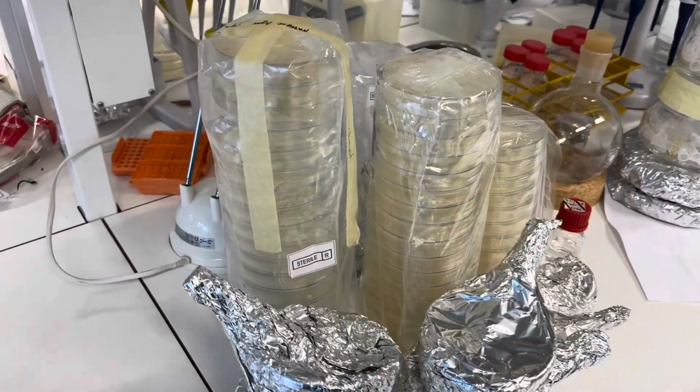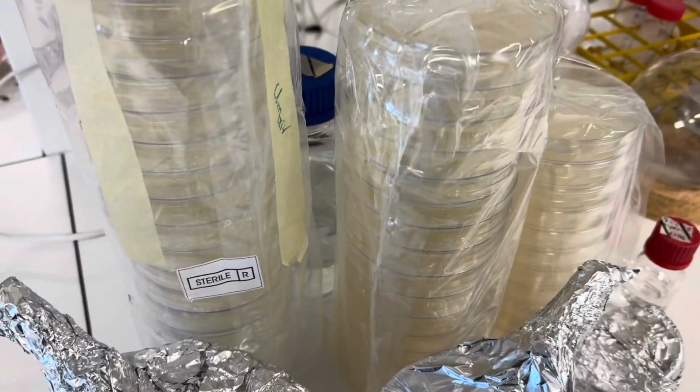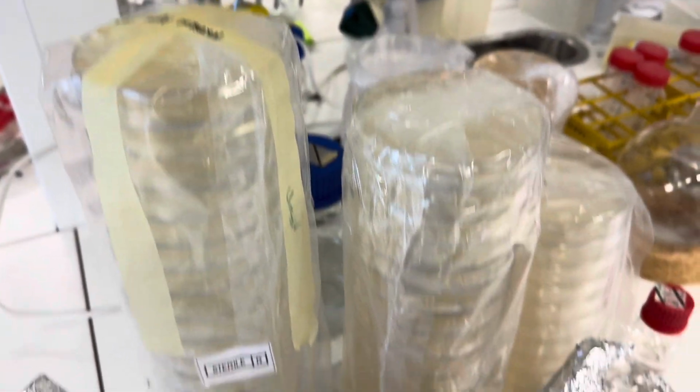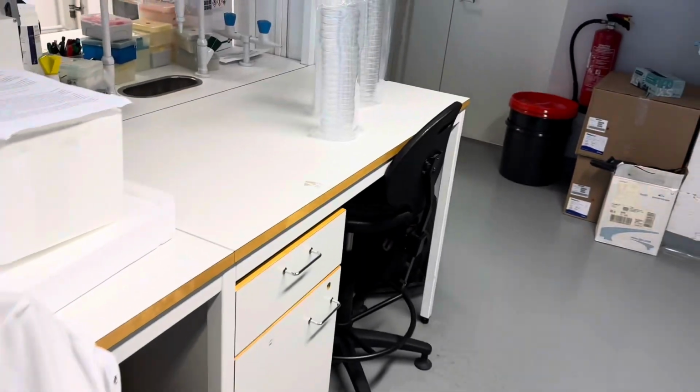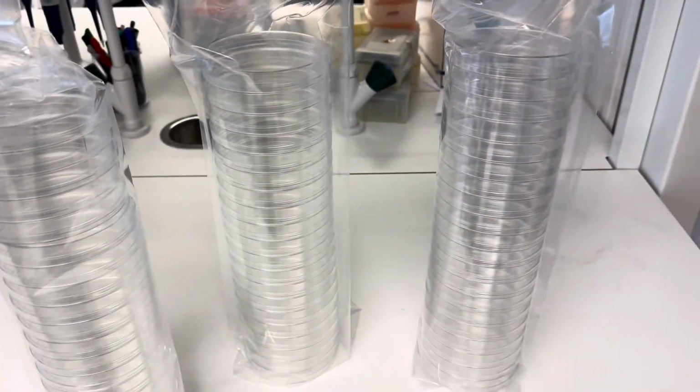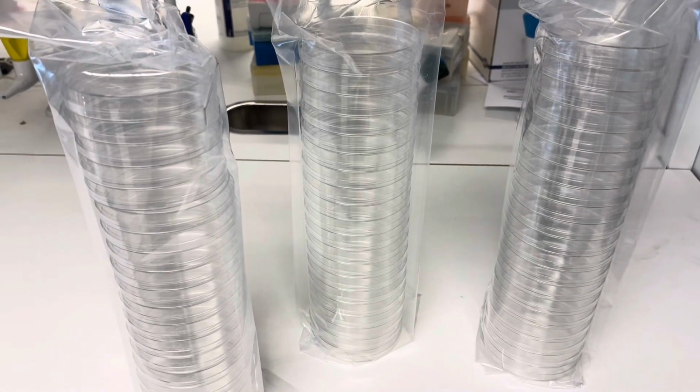Okay, so this is my table and you can see here some plates. Actually they are not malt extract agar plates, but they are nutrient agar plates. But what I will be doing is that I will fill, these are the empty Petri dishes, so I will be filling these dishes with the malt extract agar.